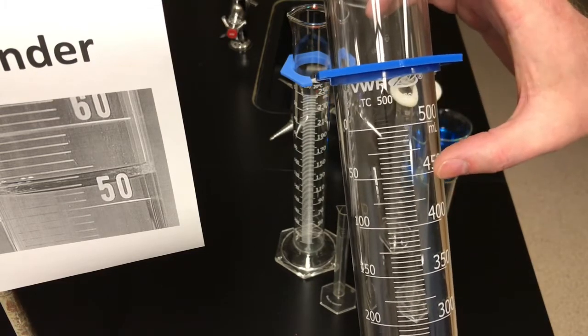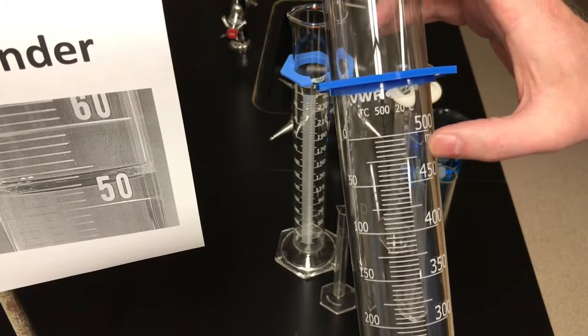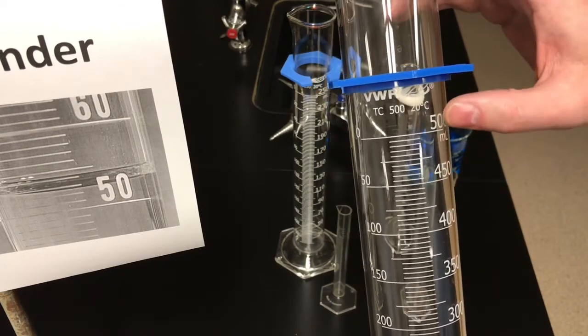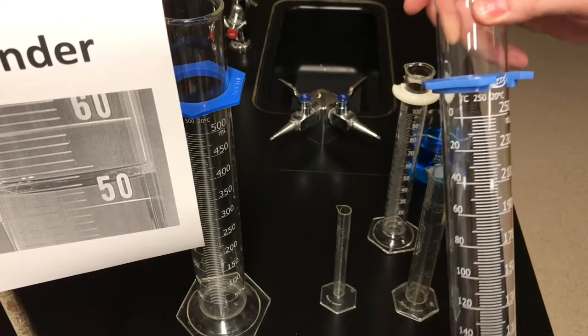So counting through: 450, 455, 460, 465, 470, 475 is right in the middle, then 480, 485, 490, 495, and 500. You can check your understanding of the major and minor scale by just counting like that.